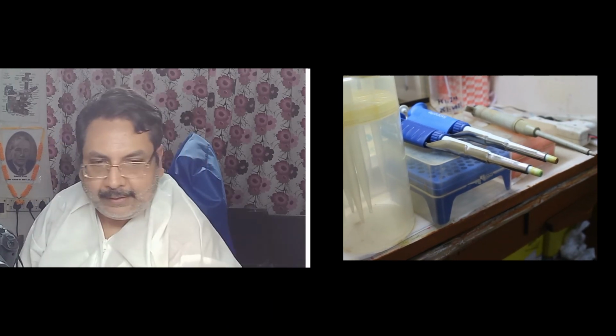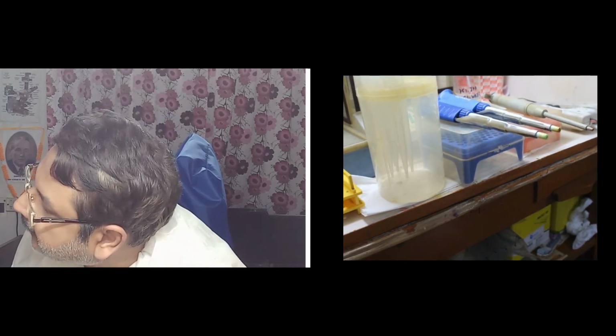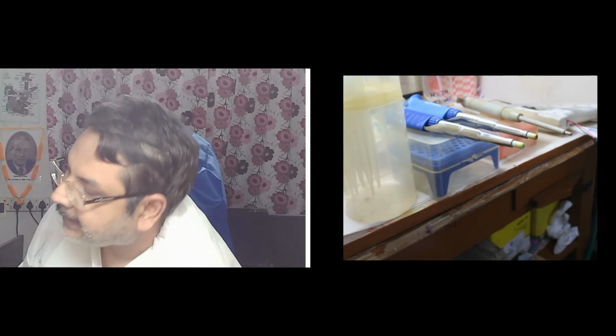You can see in the camera. If I move the camera a little bit back, you can see in this camera the whole set is coming. Yes, the whole set is coming, so that you can see it inside the camera.